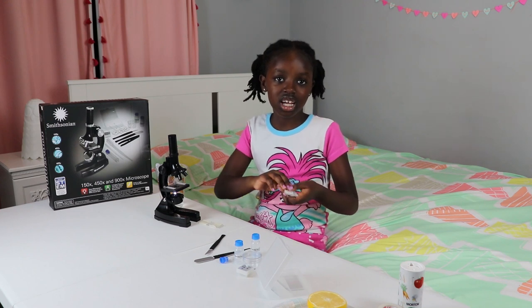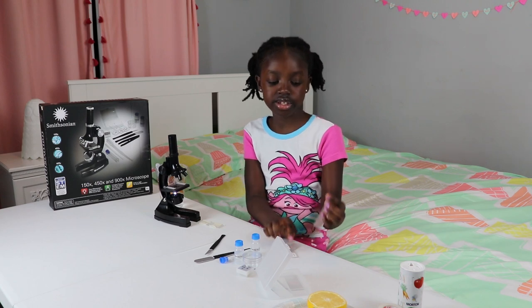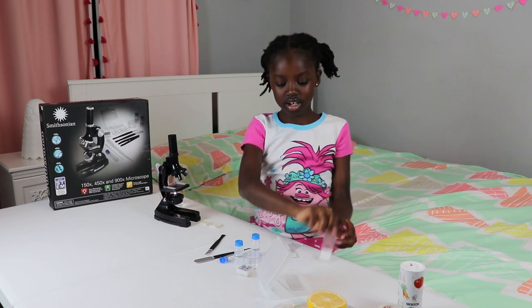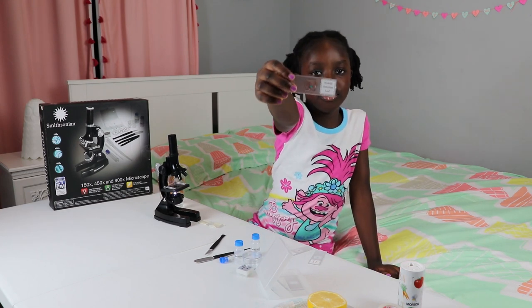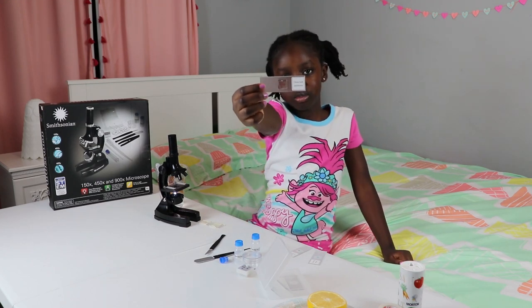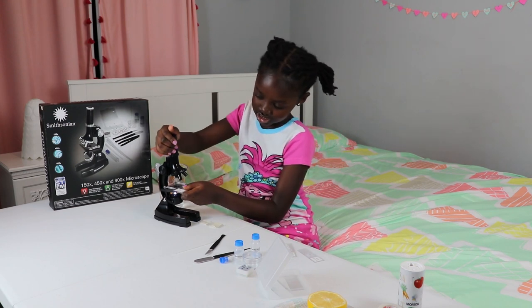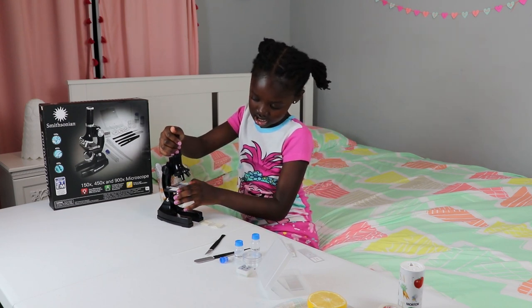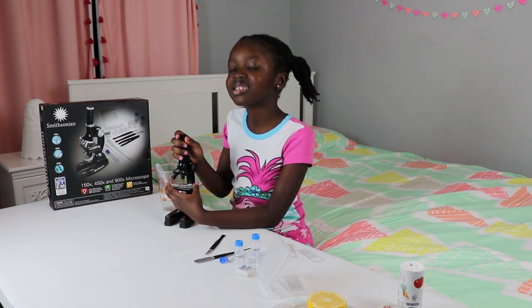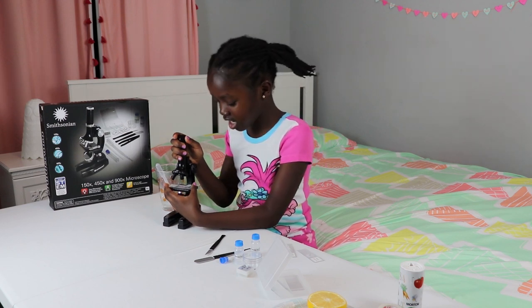These are the already-made slides. One is this bean leaf, another is this other leaf, and this is an onion bulb. I chose the onion bulb. You slide it into your slide holder, and then you look through the microscope trying to find the image.